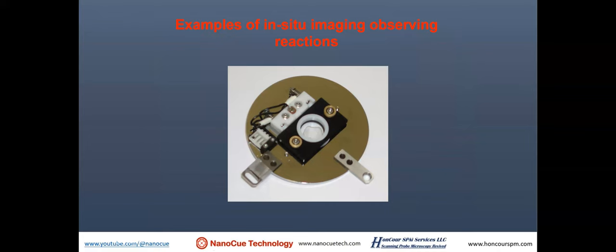Okay, the comment is: I wish I had known about in-situ scanning of annealing block copolymer during my PhD research. Yes, annealing of a block copolymer. You can see a lot of things happening. I have done a lot of these experiments.